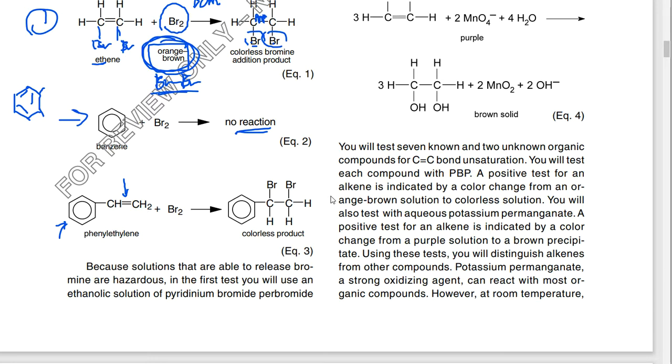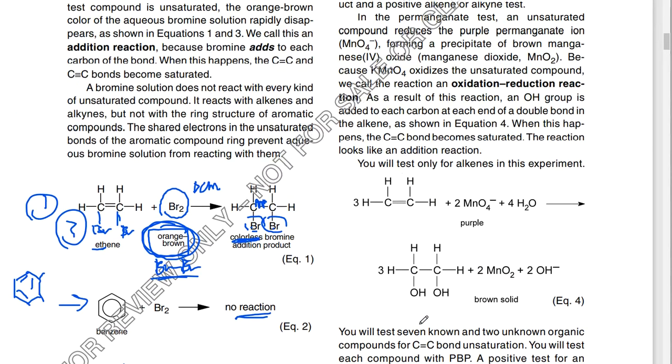So this is a very good sign that something is an alkene. That's what this is all boiling down to. So if I have a bromine source, and that bromine source is added to something that I think is an alkene, if it goes colorless, then that is probably proof that we have an alkene in that container or in that test tube.